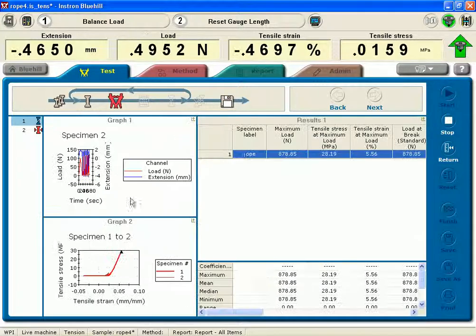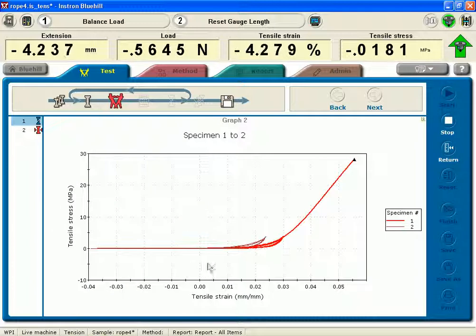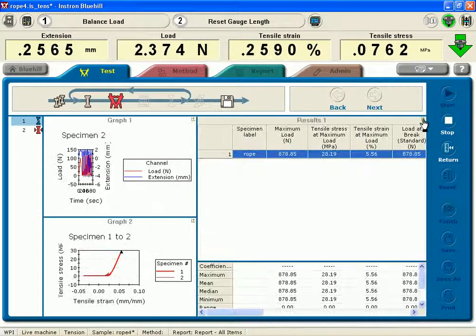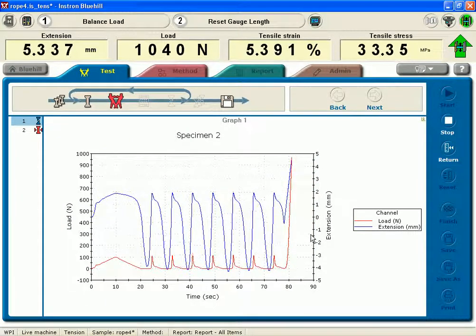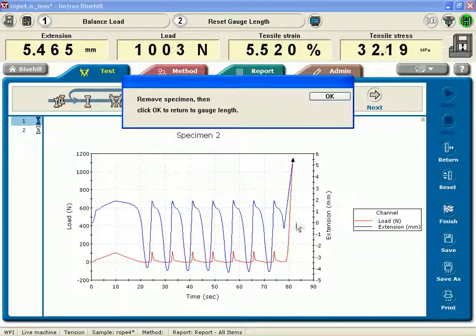If we look at the stress strain behavior, this is specimen two here. It's fairly uniform stress strain behavior, but the force over time is not held very well. And then the sample goes to 5%.